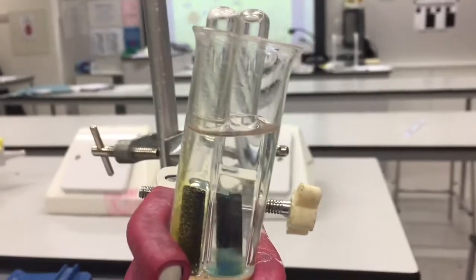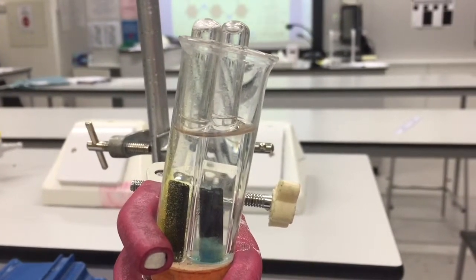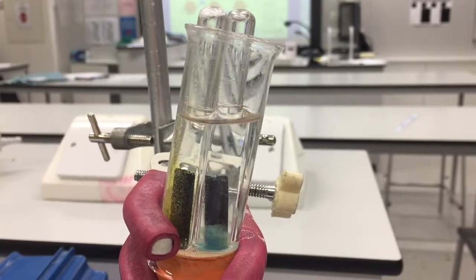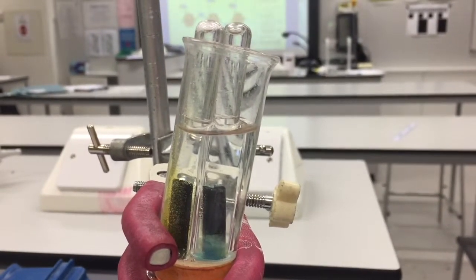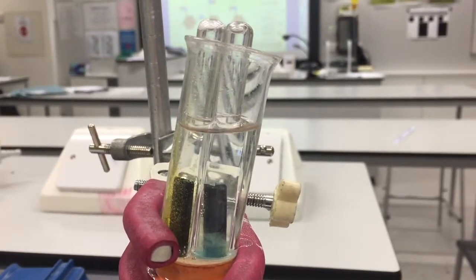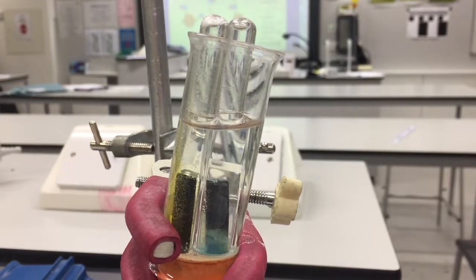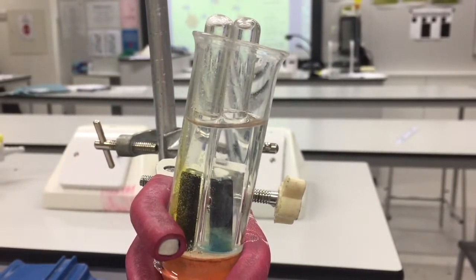Now the gas again is collecting on the surface, in the tube, and we can test for oxygen by taking a splint, blowing it out so it's glowing, putting it into the tube, and it will reignite. And again, for the exam marks, you need to be clear on all of those things. So glowing splint placed in the tube, and it will reignite.